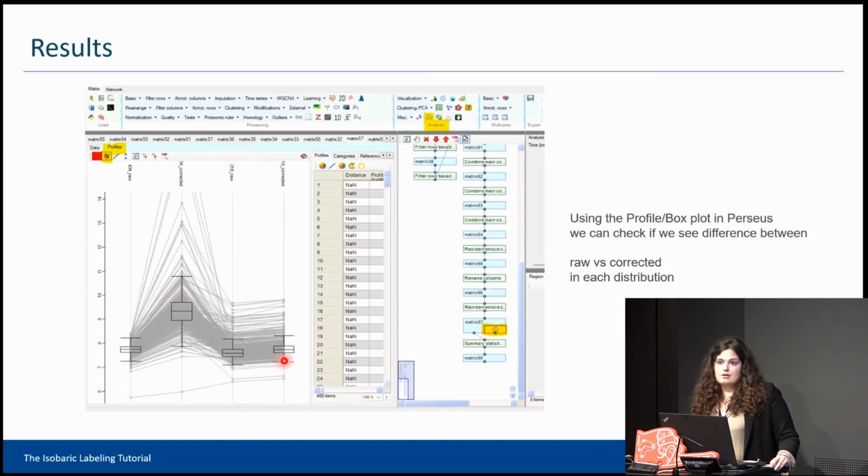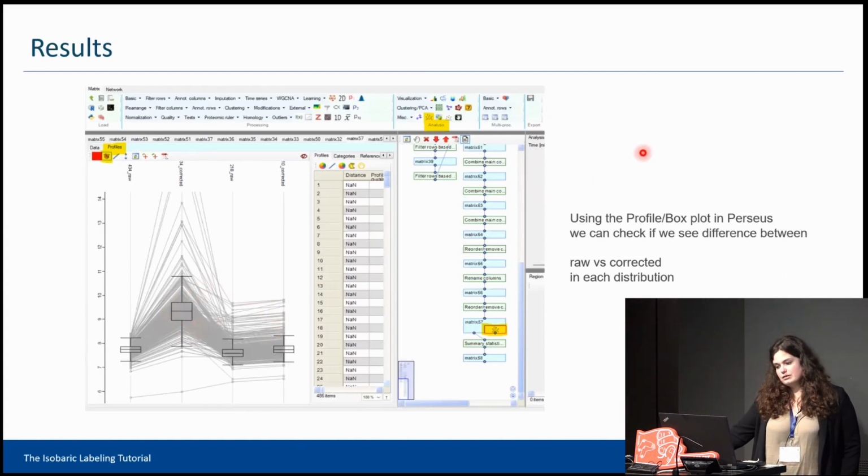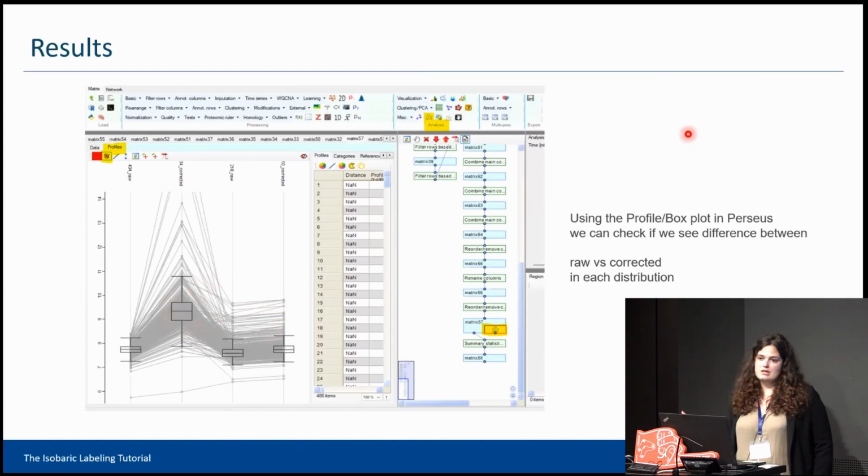You can check it by comparing this one to the results of the paper, because these are exactly the two carrier levels that they show in the paper, and you will see that you will get exactly the same results. And this proves that your correction factor worked, but most important that MaxQuant, let's say, corrects your data correctly using the correction factor that you imported. So this is how the correction factors work. As you can see, it's very basic.